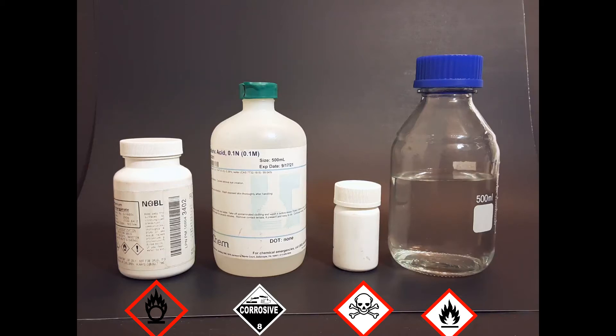In a lab, organizing chemicals correctly is extremely important. This is because most chemicals are not really compatible with each other, and this can be a serious hazard.